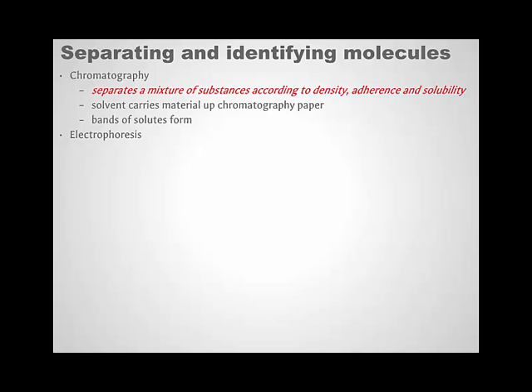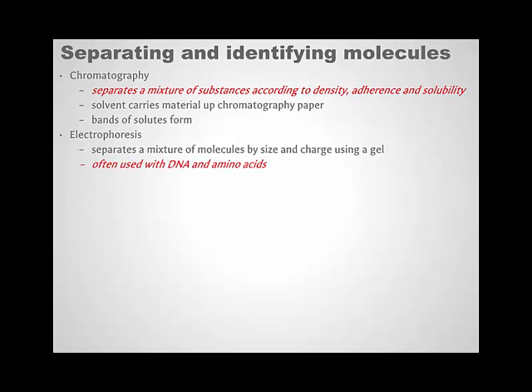Electrophoresis works on a similar concept, although you set it up differently. This is one that we model and talk about how it works, but we don't actually do it. I think I gave away my actual electrophoresis equipment to Mr. Rogan at the high school. He teaches a biotechnology class. Basically, electrophoresis you can use to separate very small molecules. Generally, we use this for DNA or proteins.